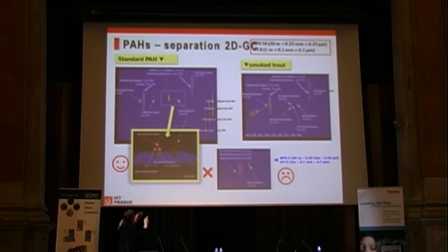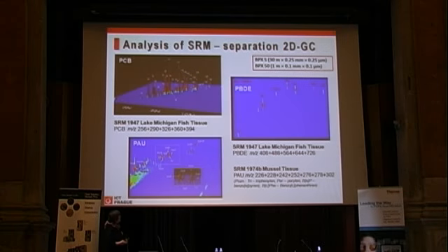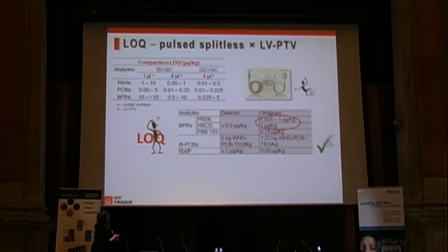And now I had a comment on the need to improve sensitivity, because that was the parameter which, when using this TOF detector, needed to be improved for the very low detection limits which we aimed at. So we had to increase our injection volume, and you can see this was our target, the desired LOQs. That was reality. So somewhere yes, and somewhere we were a little bit above.